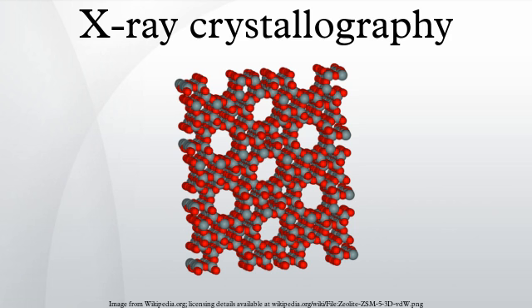The method also revealed the structure and function of many biological molecules, including vitamins, drugs, proteins and nucleic acids such as DNA. X-ray crystallography is still the chief method for characterizing the atomic structure of new materials and in discerning materials that appear similar by other experiments. X-ray crystal structures can also account for unusual electronic or elastic properties of a material, shed light on chemical interactions and processes, or serve as the basis for designing pharmaceuticals against diseases.